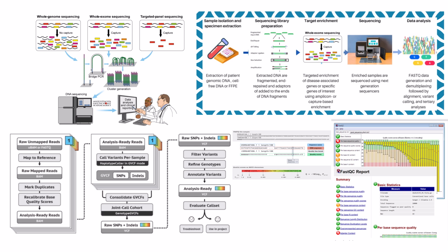Yeah. A post-trim quality check, often running FastQC again, just confirms the cleaning worked and the data quality is looking good. Makes sense. And because you might run QC multiple times on multiple files, there are tools like MultiQC that are really handy. They gather up all the results from the different QC steps and tools and put them into one single summary report. Gives you the big picture. Exactly. A quick, high-level view of data integrity.